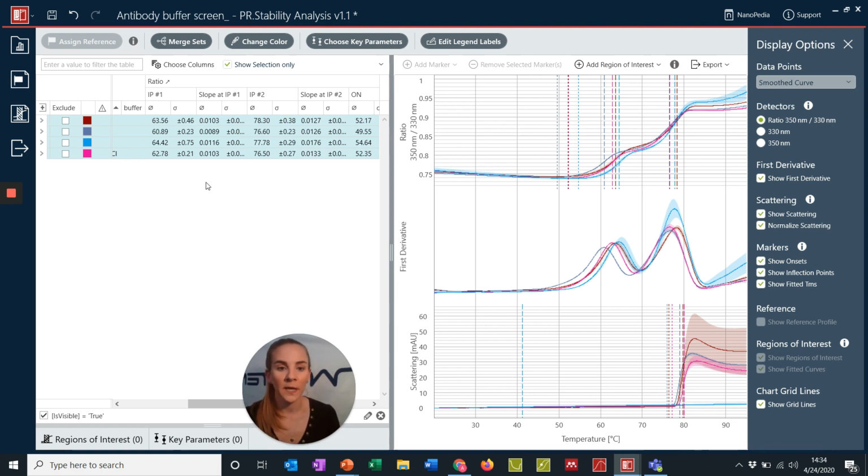So this was something that traditionally you probably did by eye in looking at, say, the width of one peak in comparison to another. Say those samples had the same TM values, however, one peak was more broad than the other. This is now a quantitative measurement that we can put on that we no longer have to eyeball by looking at the unfolding profiles.